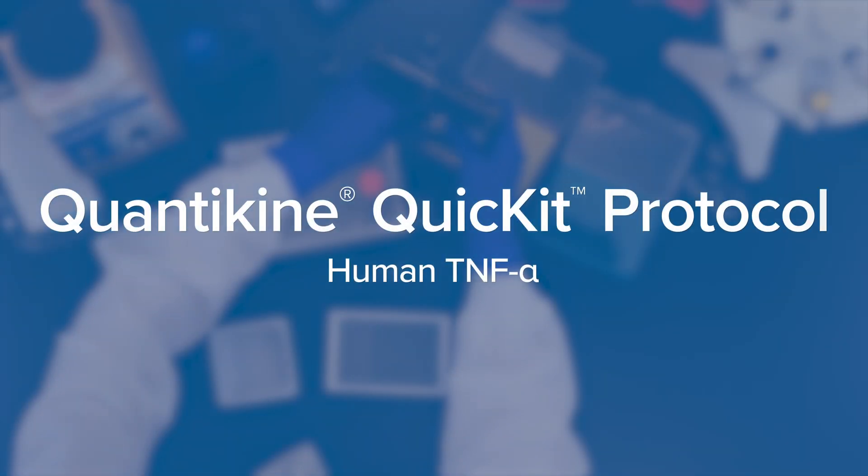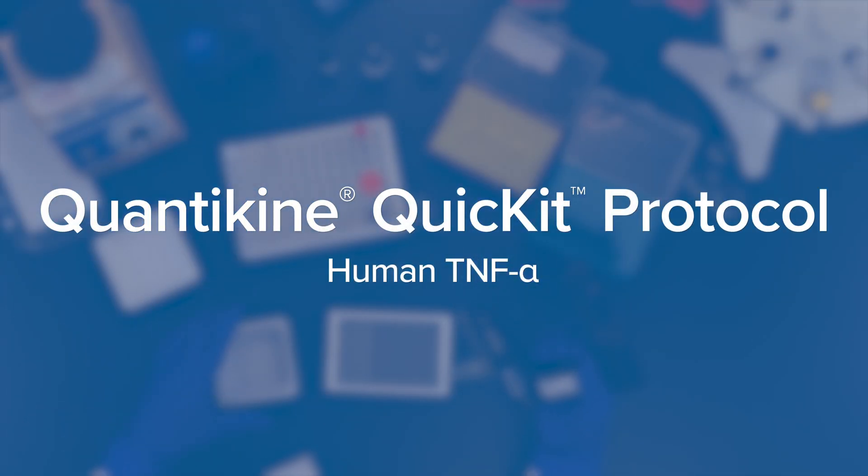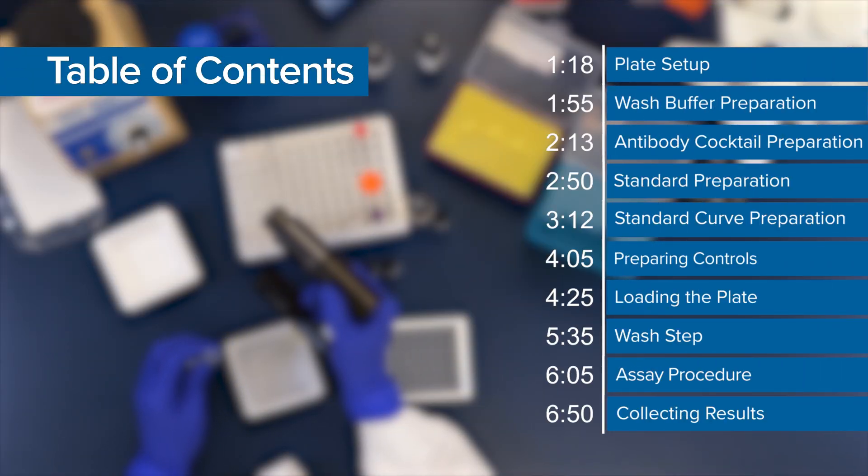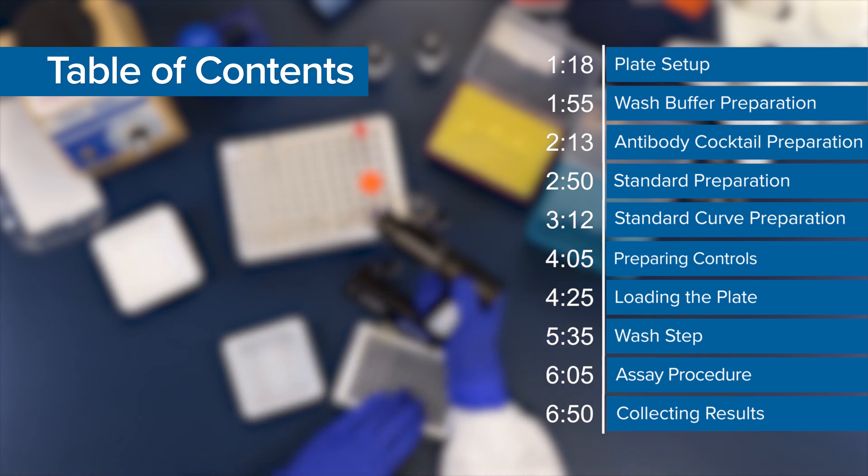This video is a general step-by-step guide for running an R&D Systems Quantikine QuickKit ELISA. QuickKit ELISAs offer a shortened protocol of under 90 minutes with a single wash step for the detection of proteins in various sample types.